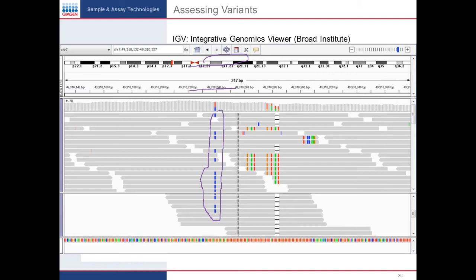So here we have a heterozygote being displayed, and it looks real clean. It goes across lots of different sequences. As opposed to, you know, you see something like this that doesn't look quite so compelling. It looks like artifact. In fact, all this stuff over here looks pretty dirty to me. It's all happening at the end of sequences. It just doesn't have that same clean appearance and non-randomness across these sequences.